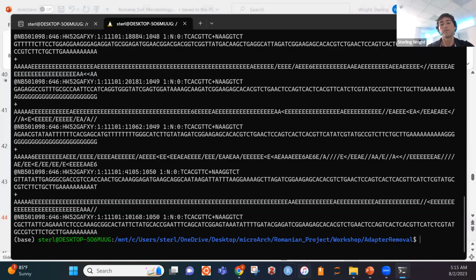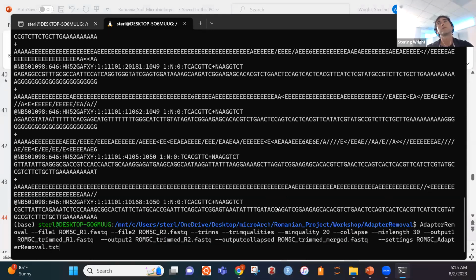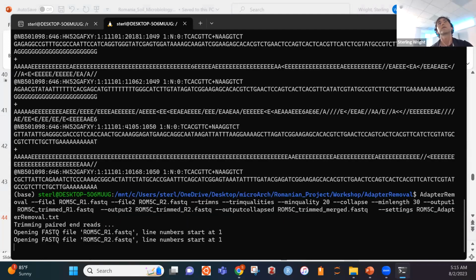All right, so I think I still have that pasted. Yeah, so I'm going to just run adapter removal on my terminal. And this can take a second because as we looked at over there, we have over 19 million reads.